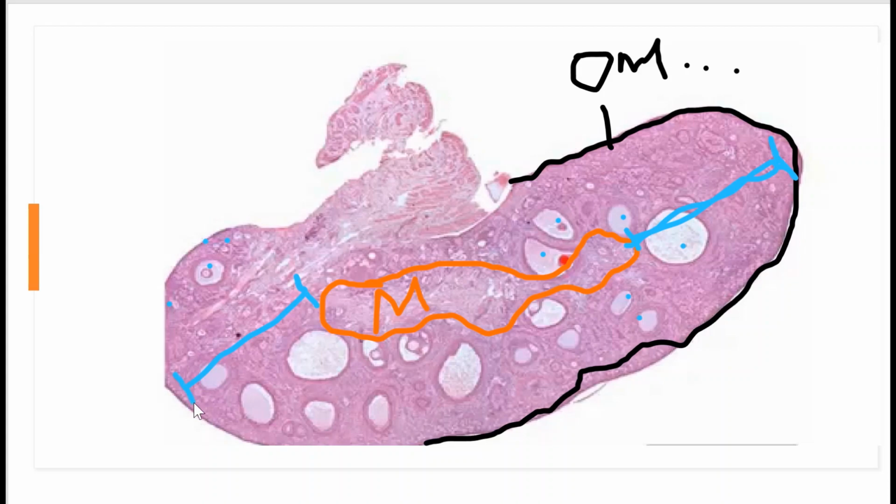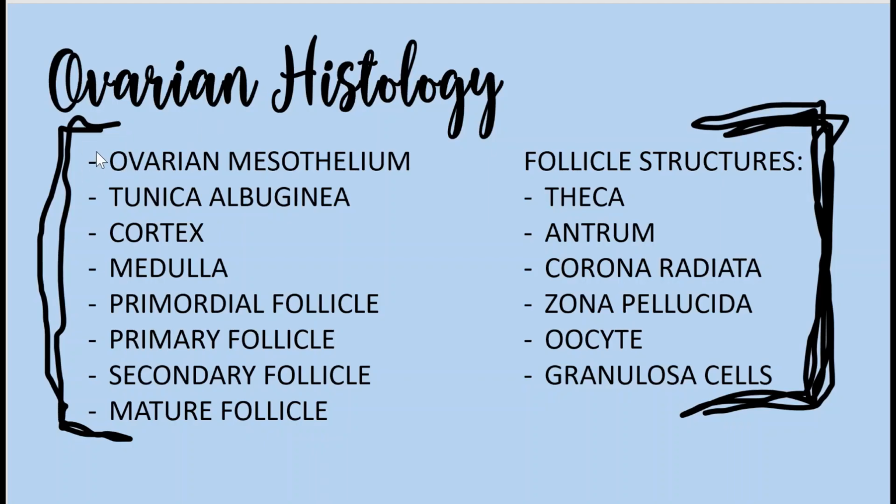Cortex. All right. We've hit this one, this one, this one, and this one. So now we're going to do our follicles.